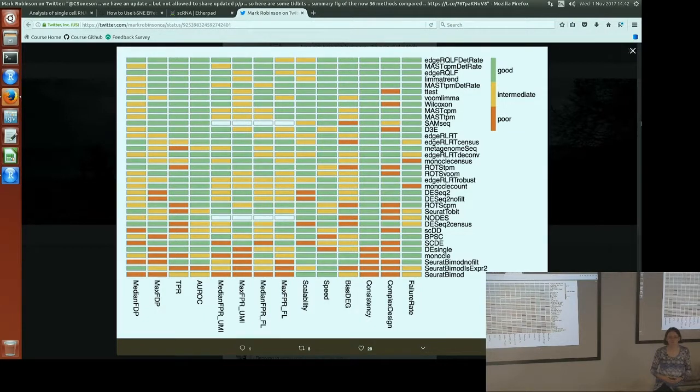Yeah, this is only for comparing discrete groups. This isn't for along pseudotime. As far as I know, there's only one specific pseudotime method, which is called BEAM, and it's part of Monocle. But for any of the GLM methods, you could just use pseudotime as your predictor.